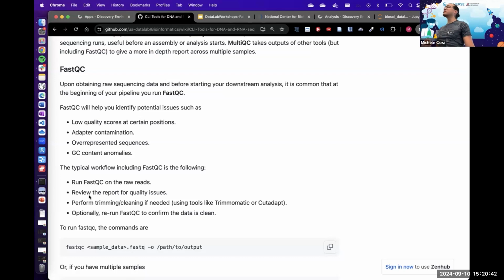Yes. Is FastQC basically what everyone uses, or are there other options that we're just not going to cover today? Honestly, FastQC is the standard. Yeah. Strongly suggest getting used to understanding FastQC. Later today, I'm going to talk a very little bit about MultiQC, but MultiQC is an aggregator. FastQC is the one that actually does the reports.